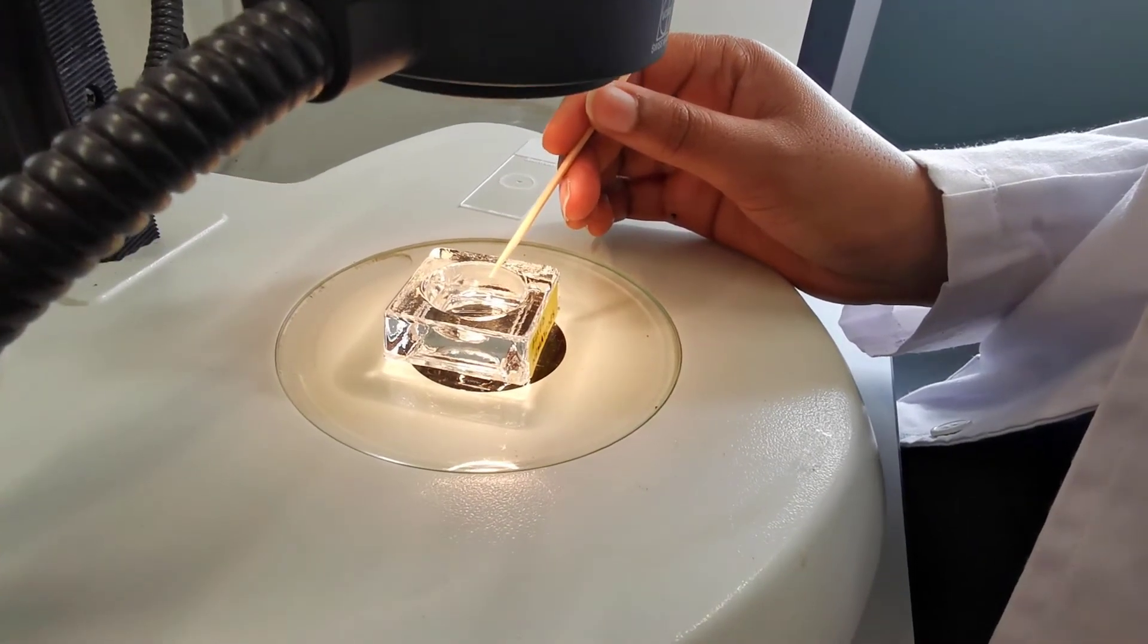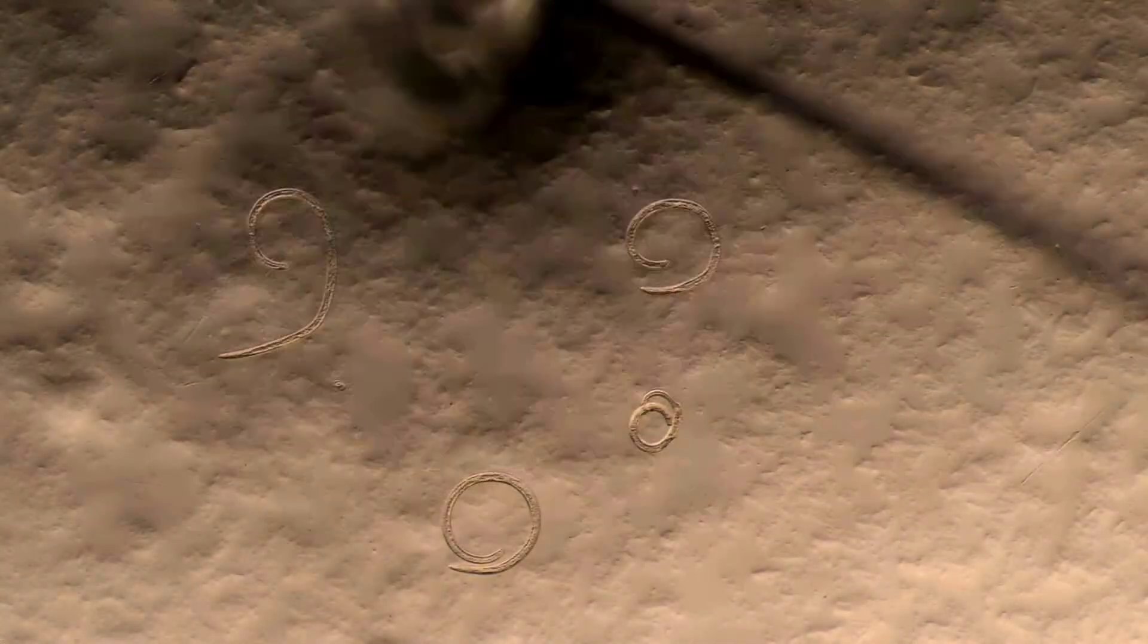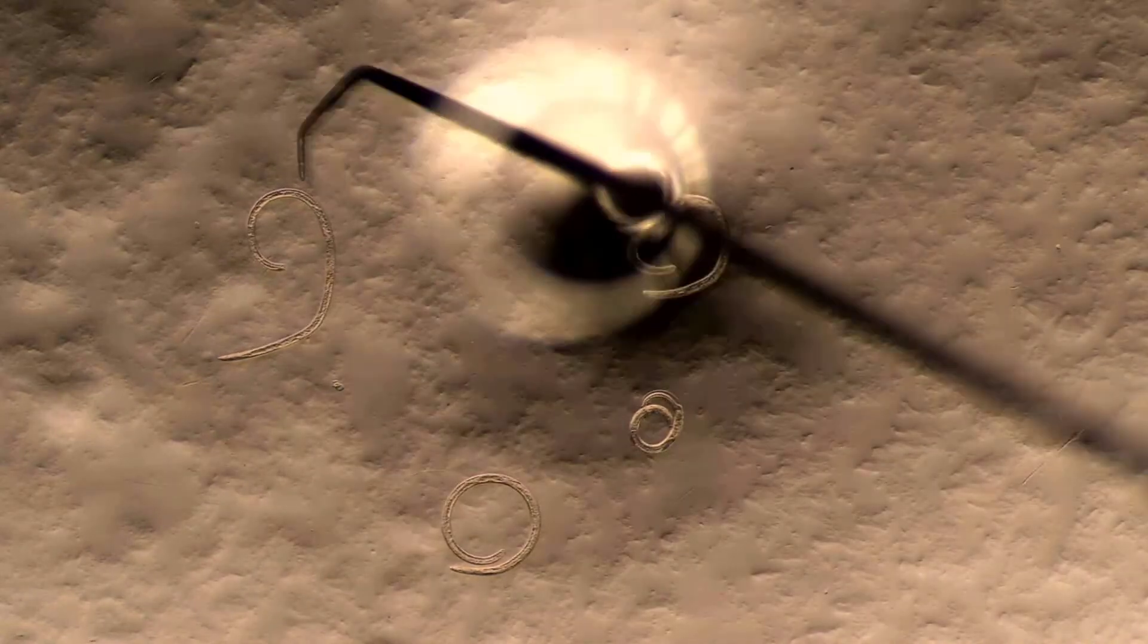One of the fixed nematodes is picked out using a worm picking tool to be transferred into the drop of glycerin created on the glass slide.